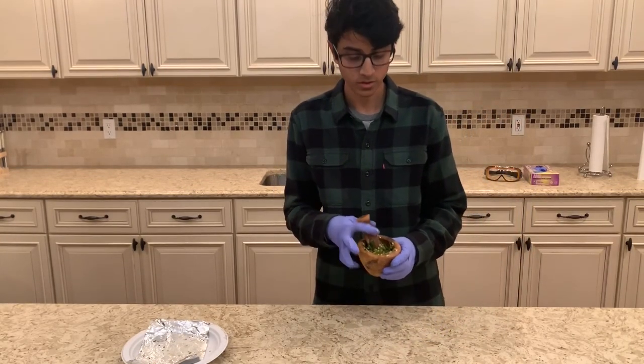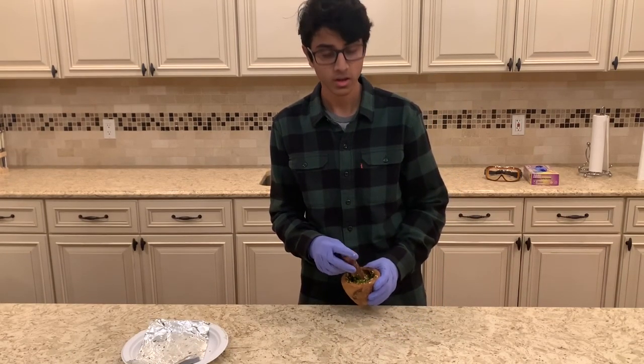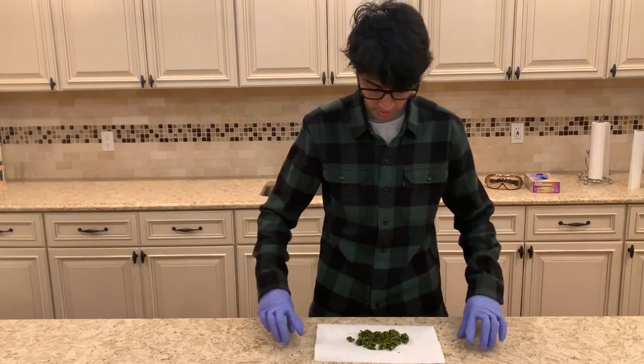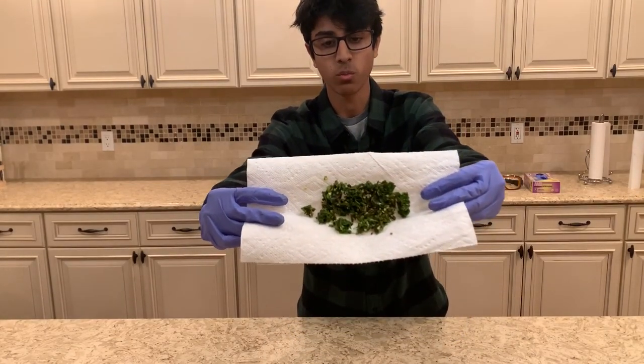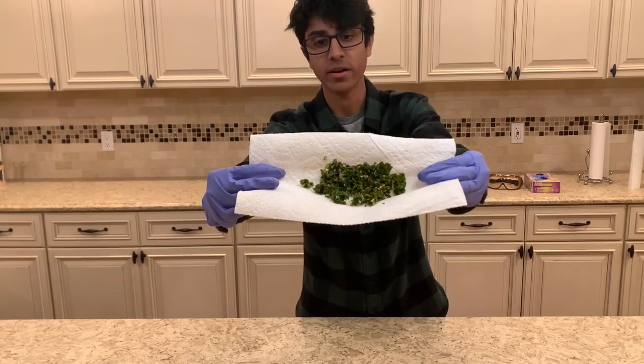It's not getting completely ground up this way, so I think I'm going to put it in the blender for a little bit. So I ground up the peppers more in the blender, but it's still too moist, so I'm going to let it sit out here for a day and let it dry out naturally.